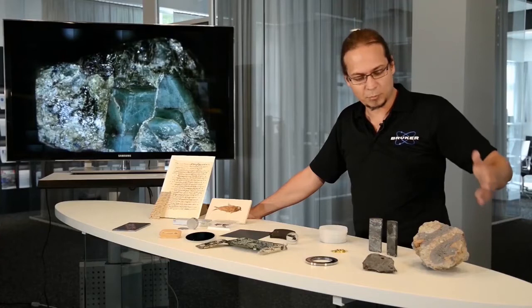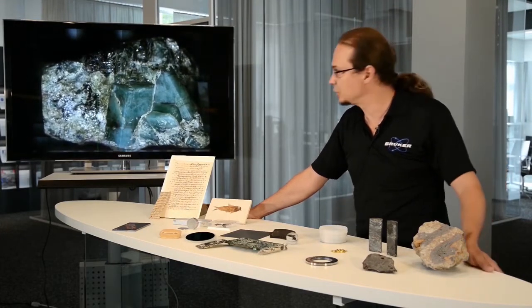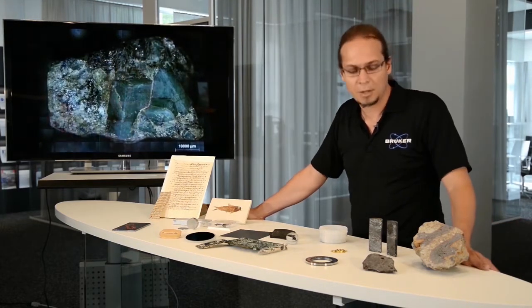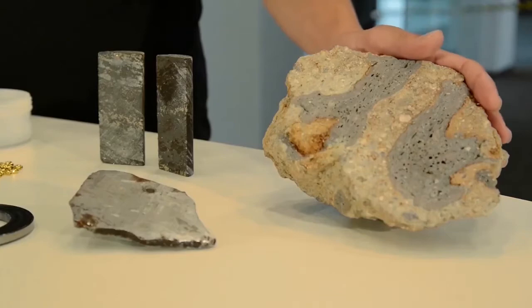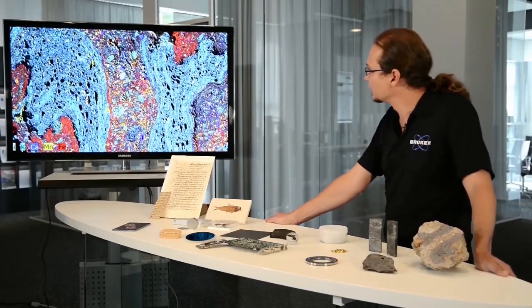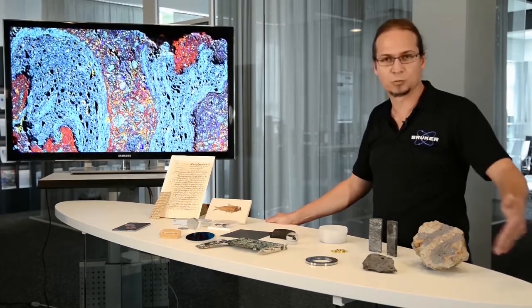Micro-XRF is a technique that combines the element sensitivity of the X-ray fluorescence with a spatial resolution given by a focused X-ray beam. This means that we can determine not just the composition of a sample, but also study non-homogeneous samples. Most samples, as you see here on this table, are non-homogeneous. And we have different examples covering, like in this case, the geology, where you can measure with the focused X-ray the distribution of the different elements within the surface exposed to the measurement.